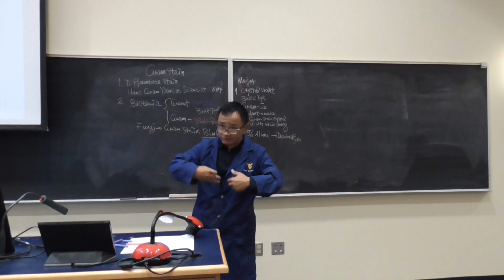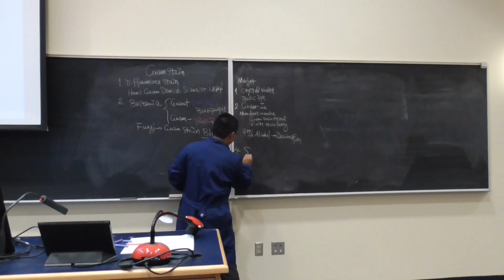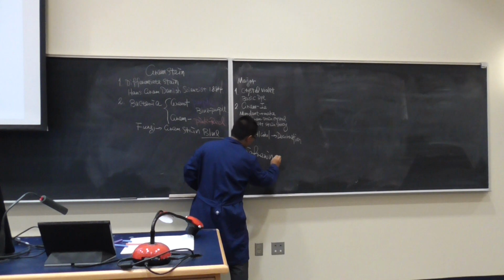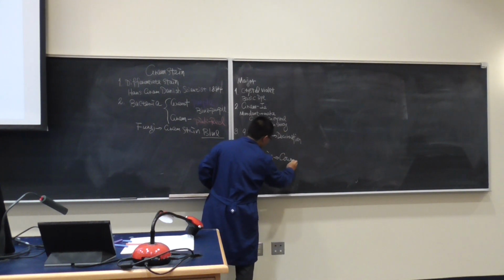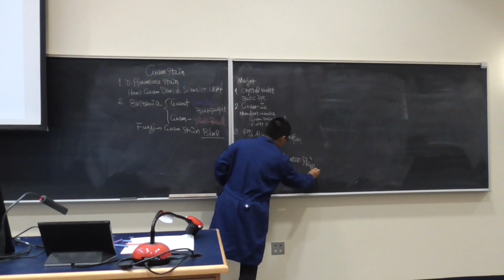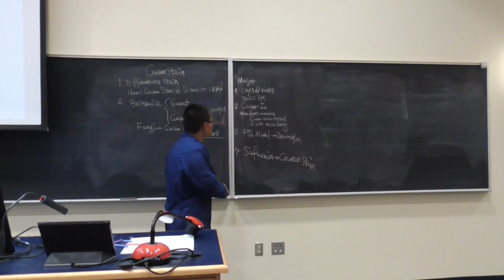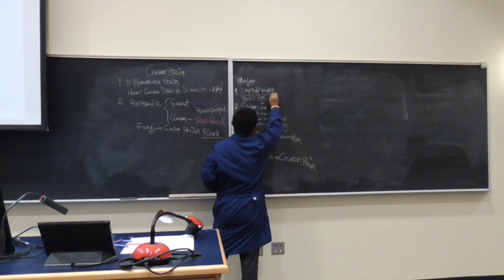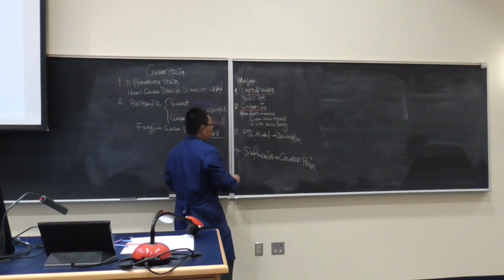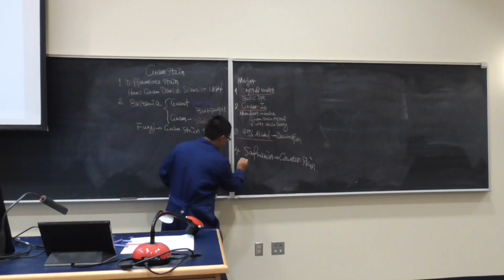So therefore we have to add something. Finally, we have to add the safranin, and we call it a counterstain. So this is the major steps: crystal violet, followed by gram iodine, decoloration with 95% alcohol, and the counterstain with safranin.